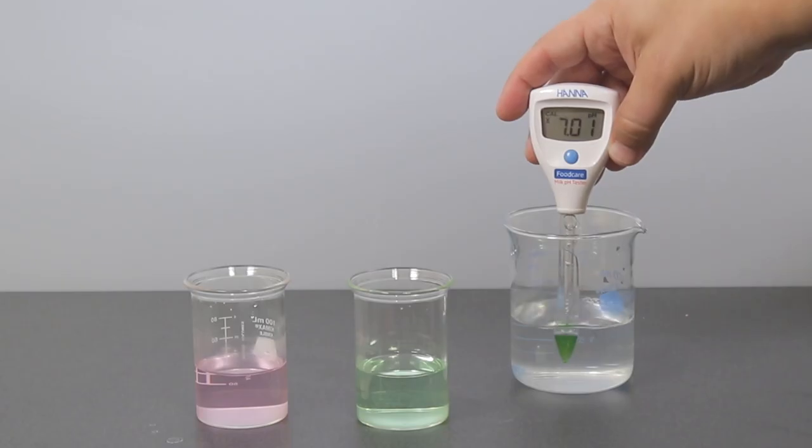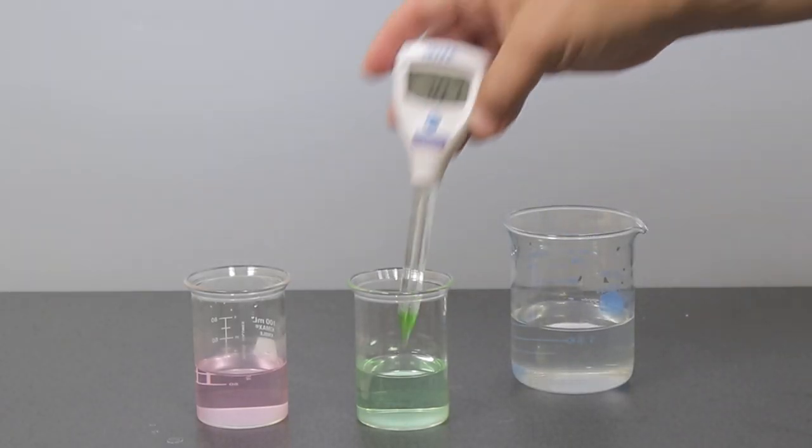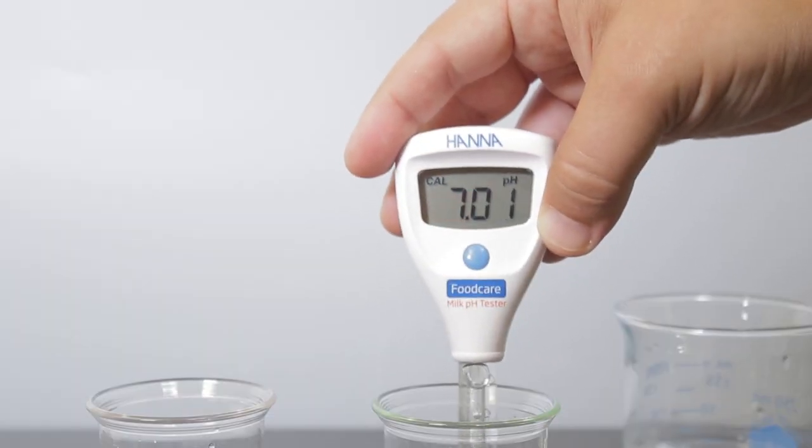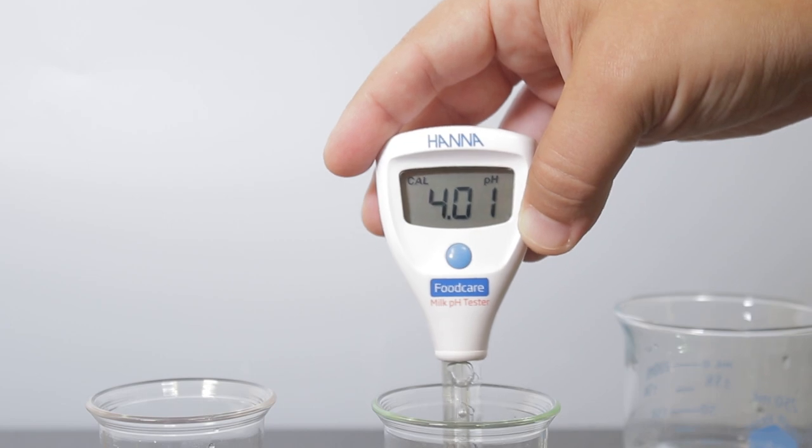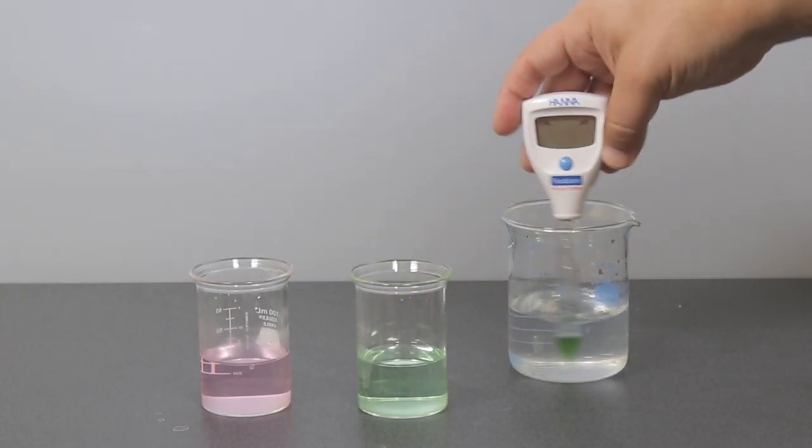Rinse the electrode in deionized water and place the tester in your pH 7.01 buffer and wait for a stable reading. Once stable, the tester will automatically store the calibration and prompt you to use pH 4.01 buffer.